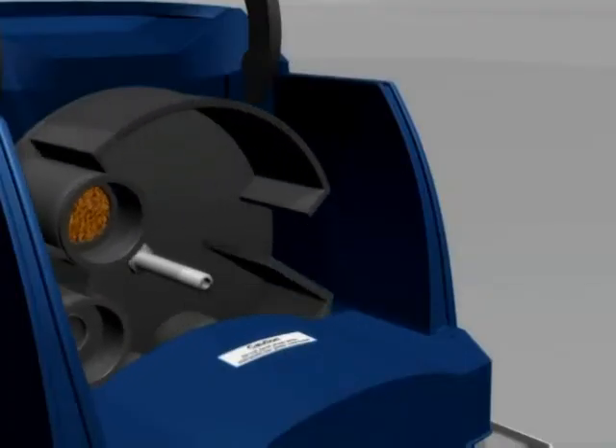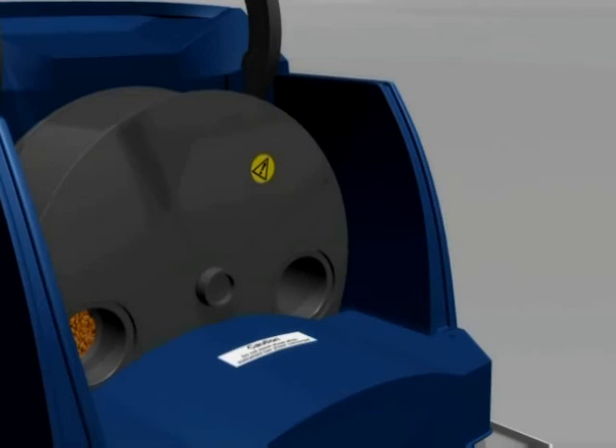You may now turn the sample handling wheel by hand to the home position and refit the faceplate. Check the notches line up as you refit it. It should click into place, then hand tighten the nut until it is finger tight.